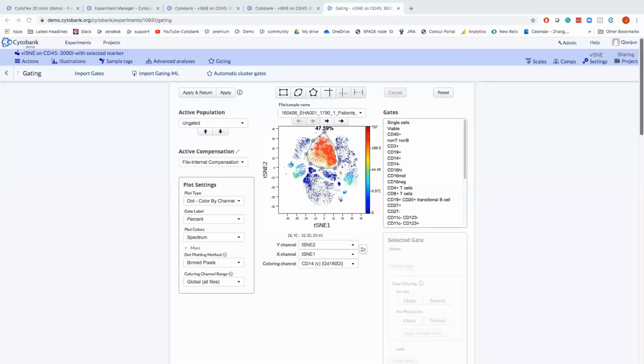We start with the default, and we give some guidelines, some recommendations for the number of iterations within the support documents. If you go to support.cytobank.org, there are some recommendations based on things like the number of events and the number of channels. I personally always like to start out just using the default of 1,000 iterations, so I can get a good, quick first look at my data. And then from there, if I like what I see, I'll set up a run with more iterations, so I don't have to wait very long to get a first look at my data.